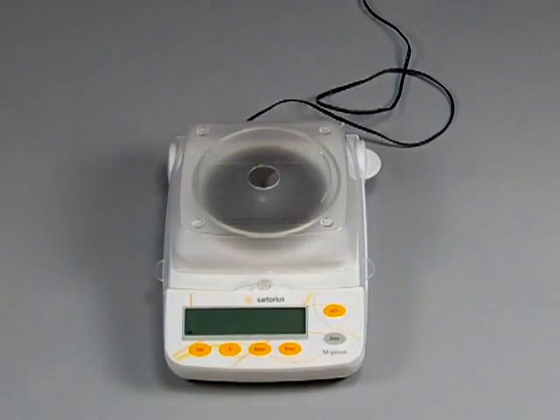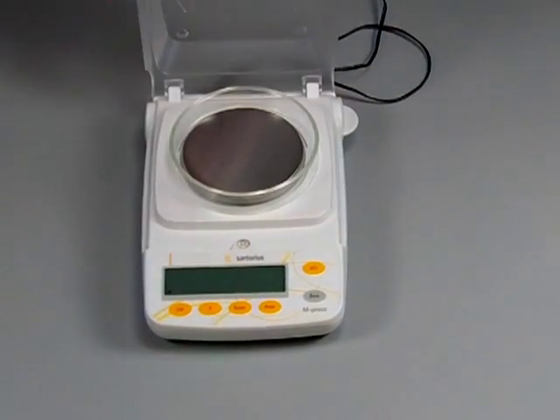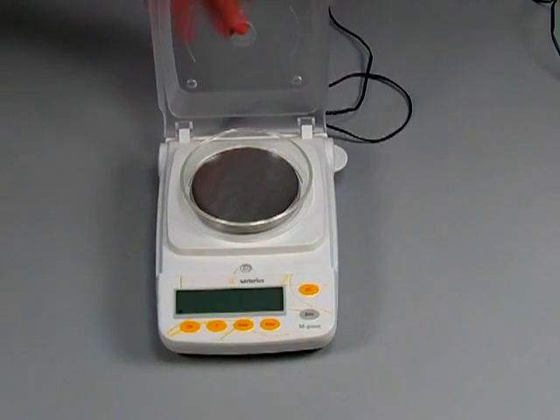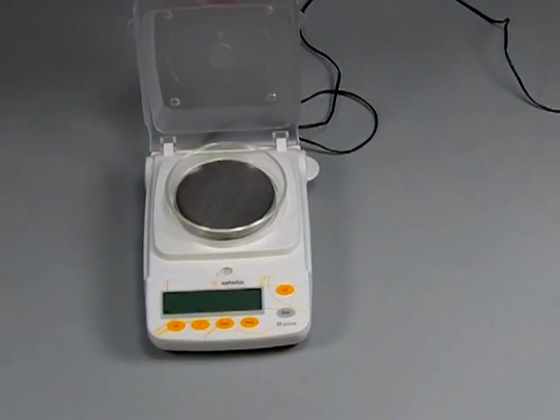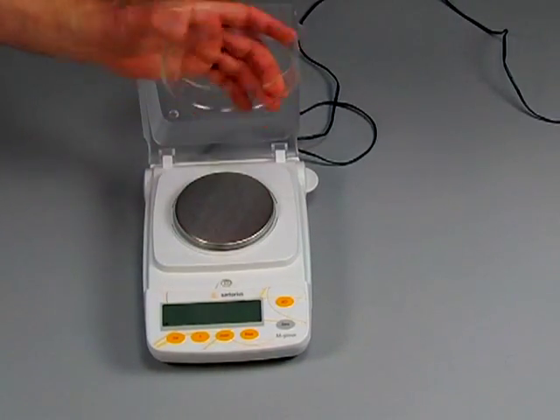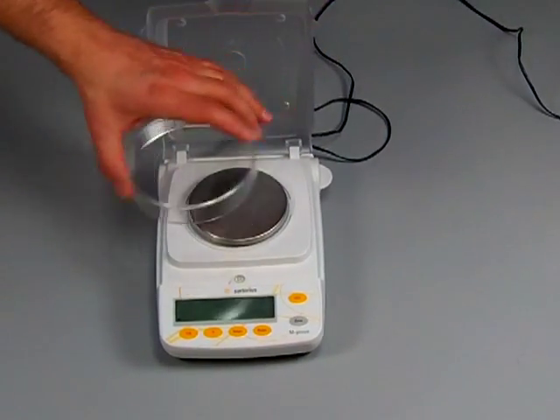The cover is removable and you do need this cover when you're dealing with a one milligram balance. This is a one milligram scale. It has this little draft shield ring. This is only on the AY 303 and the AY 123.